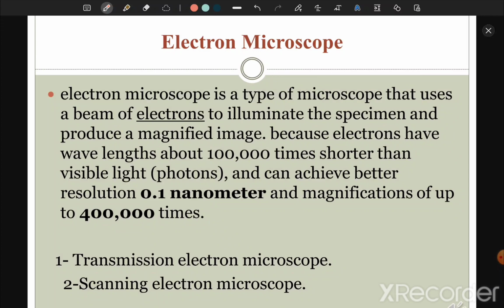Because the electron microscope has high resolution and shows the ultrastructural details that cannot be shown on the light microscope, we need a special type of preparation. So the steps of tissue preparation will differ. These general steps are the main, but the types of reagents, solutions, fixative material, and embedding material all differ between the light microscope and the electron microscope.